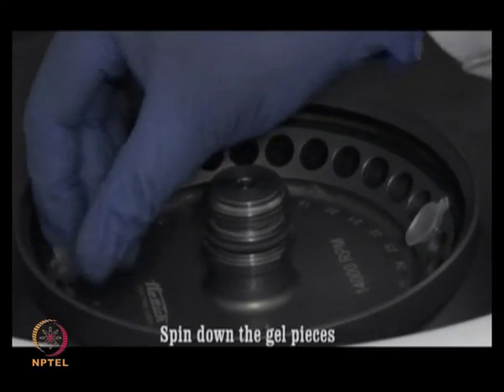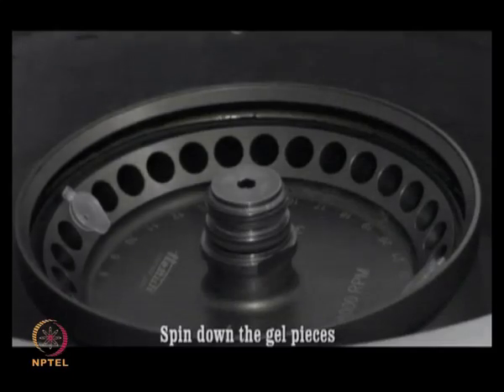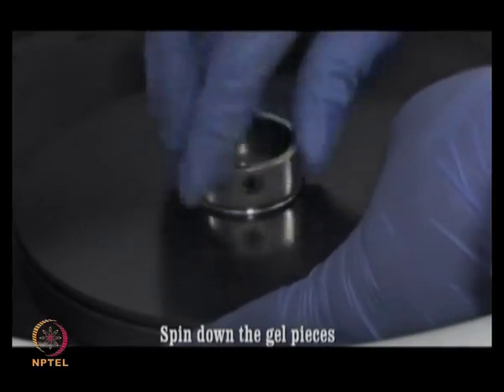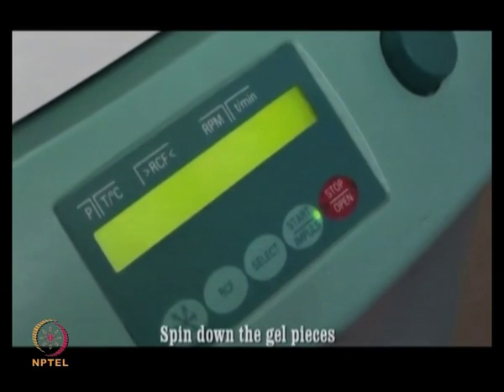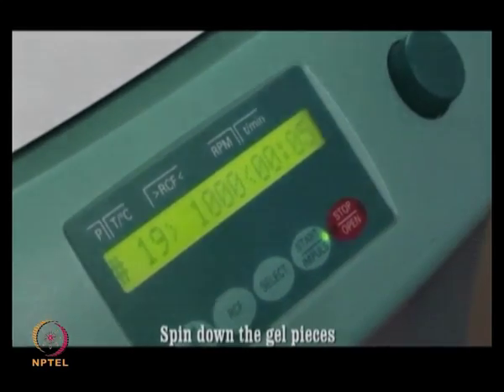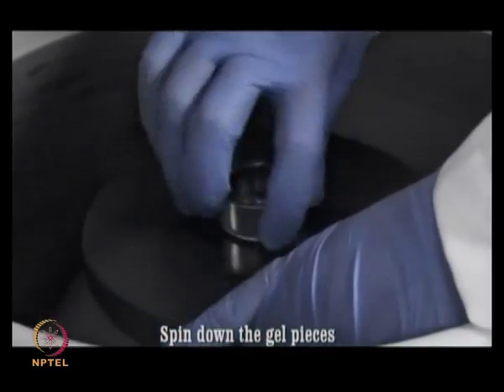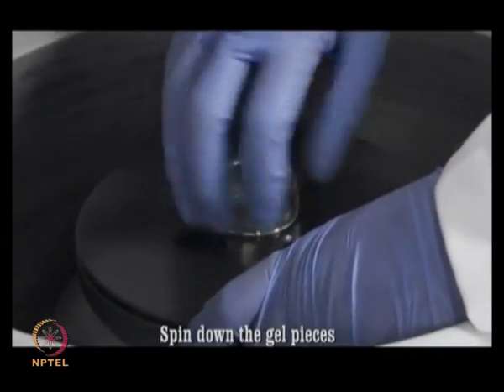Now, spin the gel pieces down at 1000 G for 30 seconds. Once centrifugation is complete, remove all the liquid.